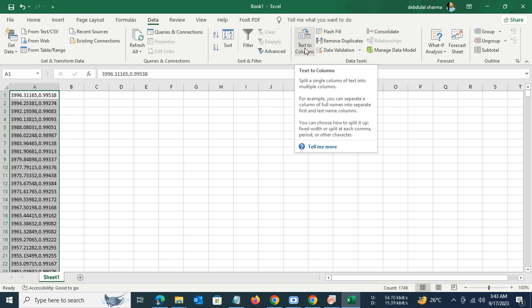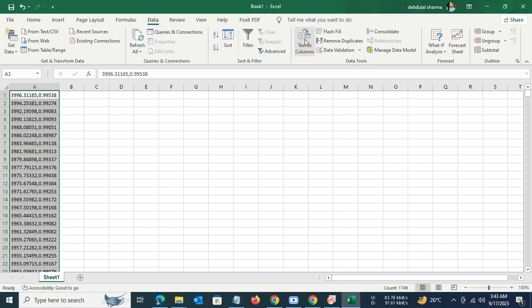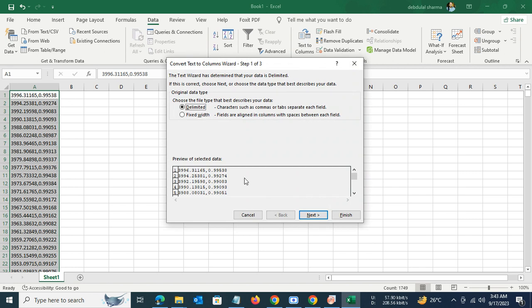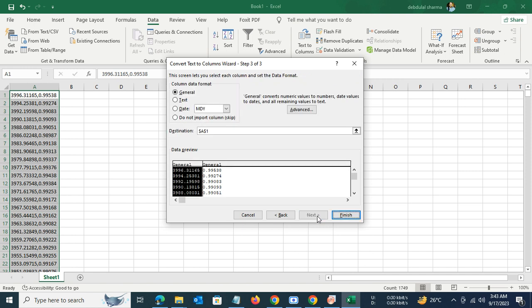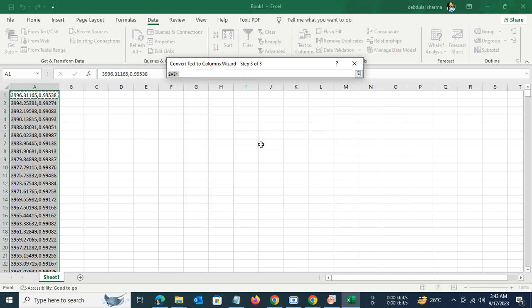We will select the text to column feature, leave the delimited function highlighted, then go to next. Select the appropriate delimiter which we want to eliminate. It's not the tab here, it should be the comma. Then click on next again and select a destination column. Let me set the destination column as B1.